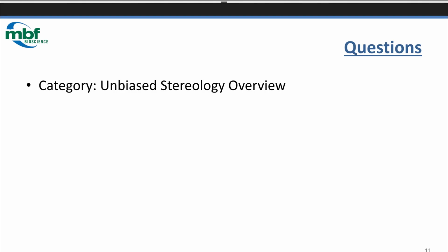People are asking about steps before stereology. That is not in the scope of today's talk. Okay, I want to use unbiased stereology. This is from Chantel, to estimate area, volume, surface area of the lung, possibly also blood vessel length.